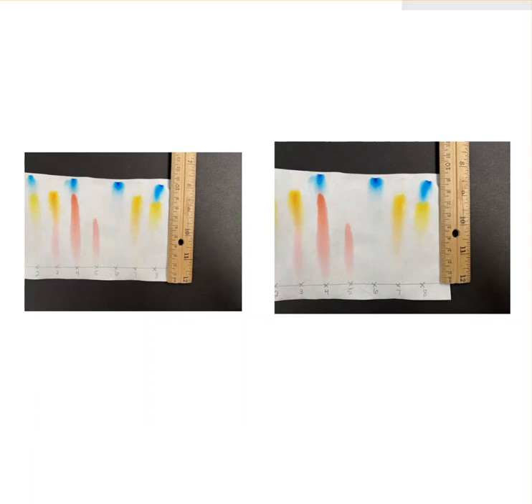And when you go to make your measurements, make sure that you don't measure from the bottom of the paper. The start line, so this is wrong. The start line is the line we drew at the beginning. That's where the spots started. So line up your ruler with that.